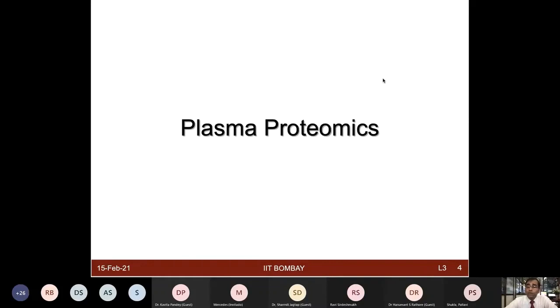If you are trying to look for a potential biomarker for a disease, and you can identify that biomarker from plasma, that could be very powerful, and it can also be clinically applicable because a test could be developed from that. A lot of ELISA kits can easily be made looking for proteins from plasma samples. So plasma proteomics is a very attractive area to investigate.